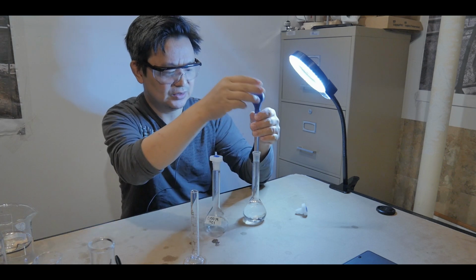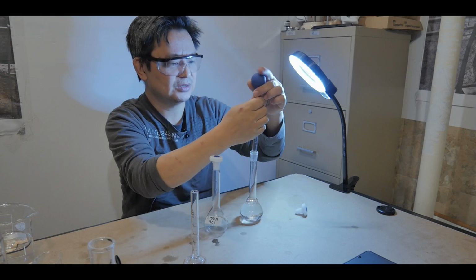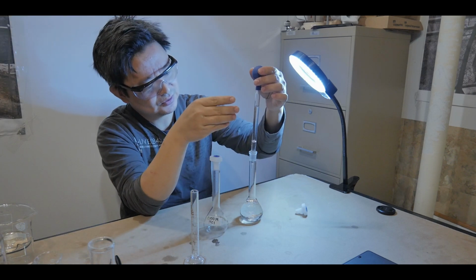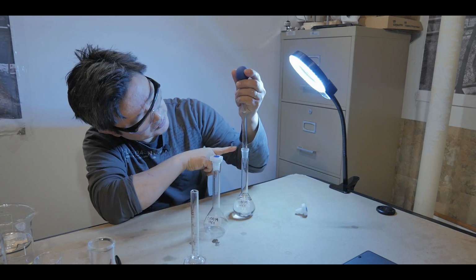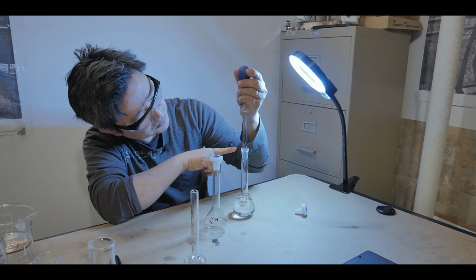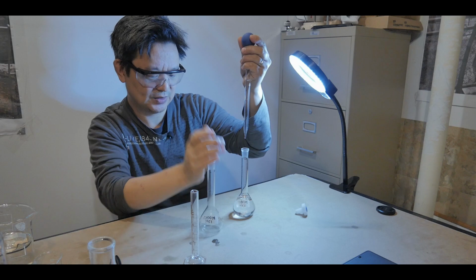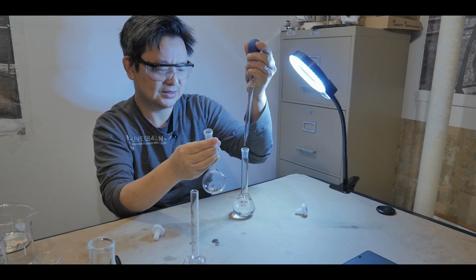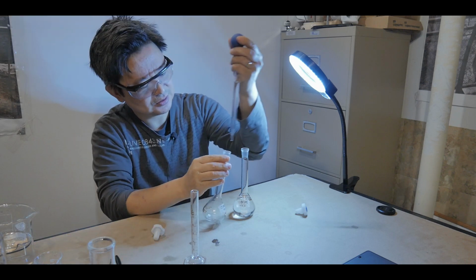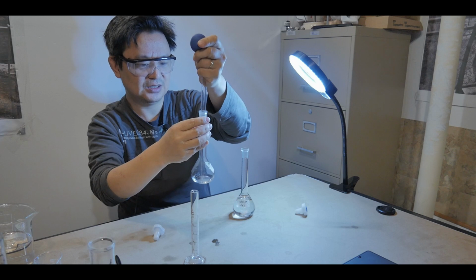So now what we want to do is take it out, and then now this is a tricky part where you have to pull out. There we go. Okay, this is it. This is exactly 10 mils. Then what you do is you put it into the other volumetric flask that you want to serial dilute. That's good. There we go. Add the 10 mils in there.